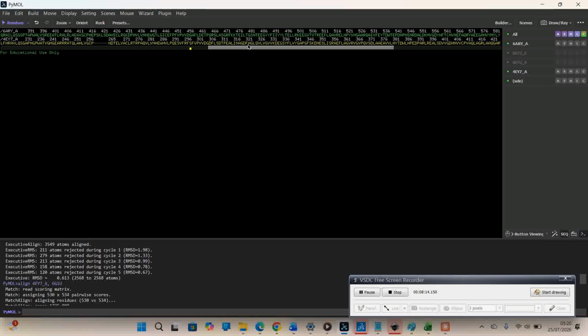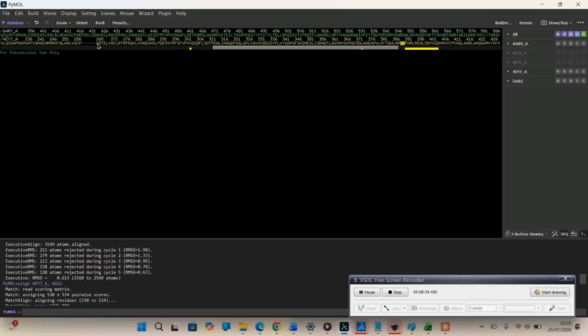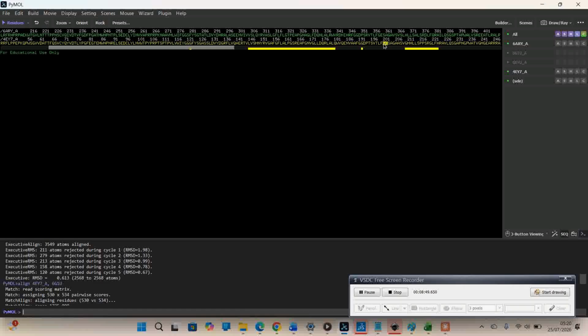If I click this, for example, and this, you will see that the two of them are here. Yes, you can select, and this is useful during cleaning. You see, anyone you select becomes highlighted. And because I'm comparing two, you see that the space you have is just for half of these two. Okay, but that's not what we want to do. We will now deselect. Okay, we need that one. Let's come back to the other ones here. Please deselect. Let's drag your mouse over.